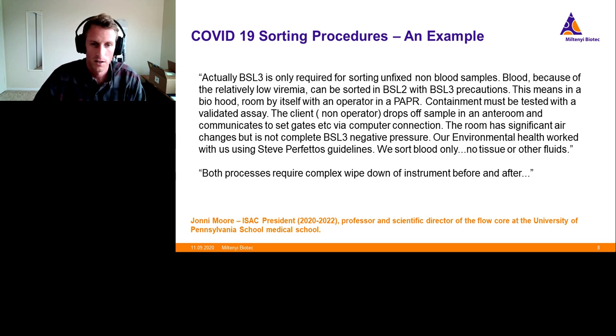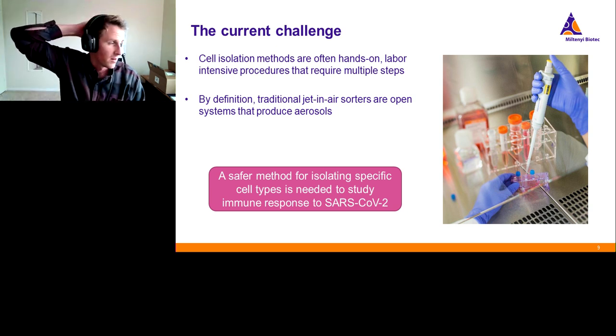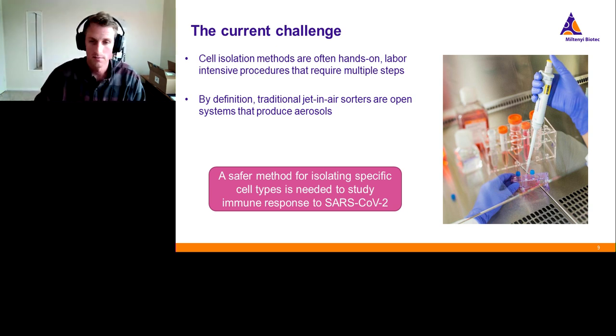So there are systems that have been put in place that help make this work, and they are mostly based on strategies that have been developed for working with HIV and other infectious diseases.